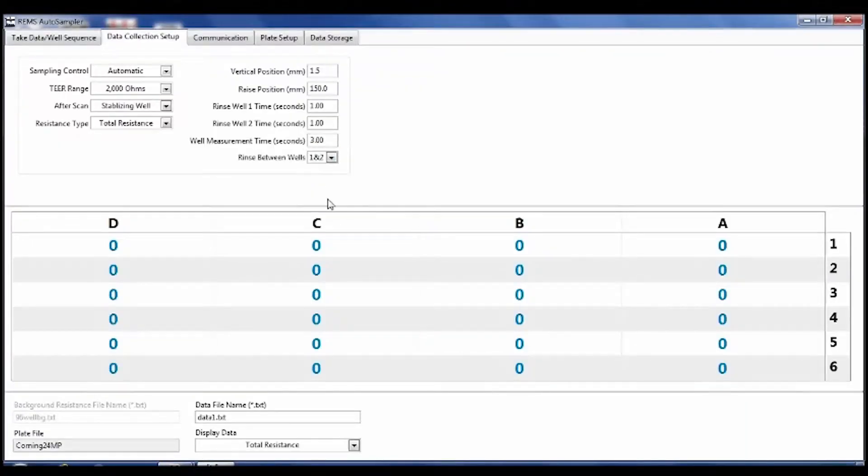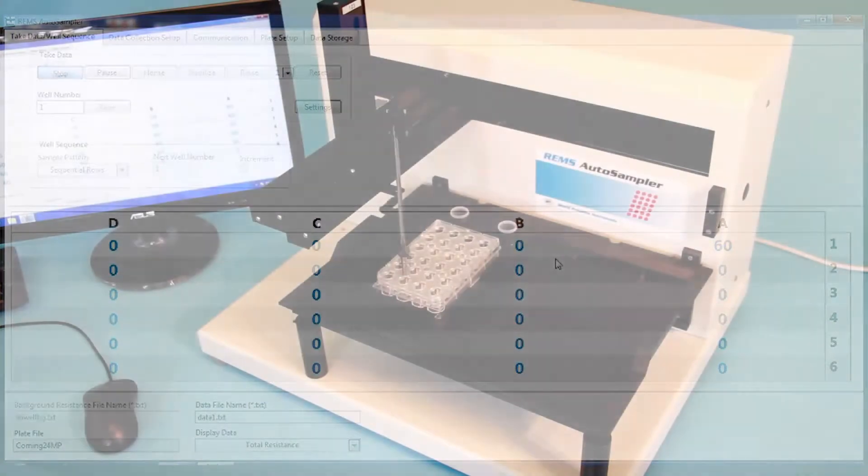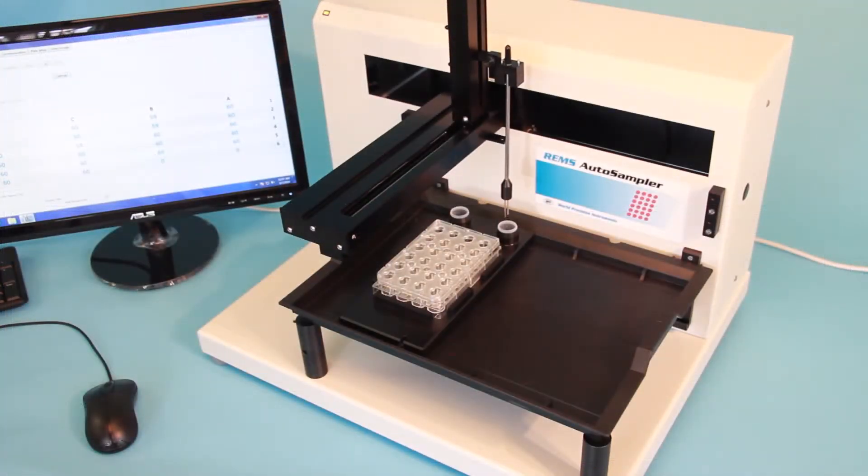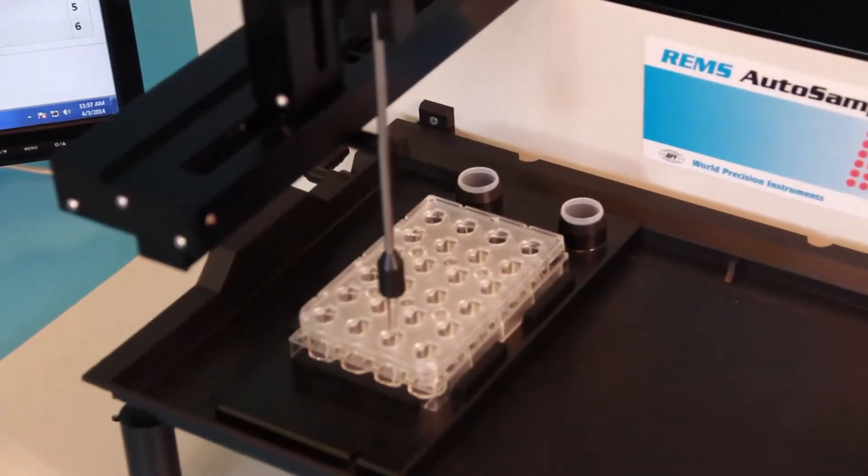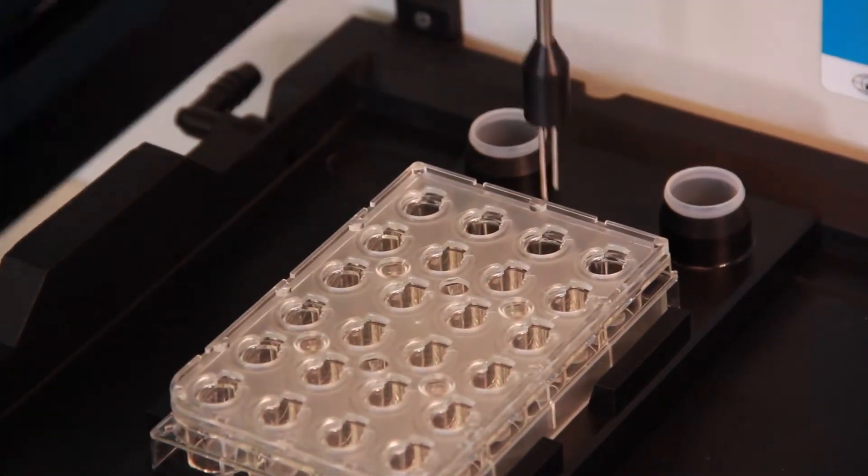In many applications, there is a concern about the prevention of cross-contamination from well to well. To address this issue, WPI expanded the system to include two user assignable rinse locations. After each measurement, you can choose to rinse at either station, both stations, or eliminate rinsing from the protocol altogether.